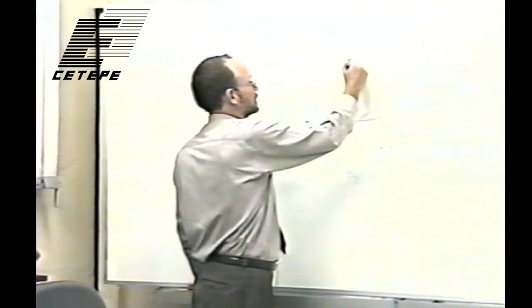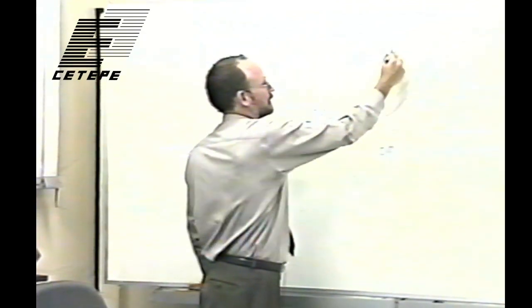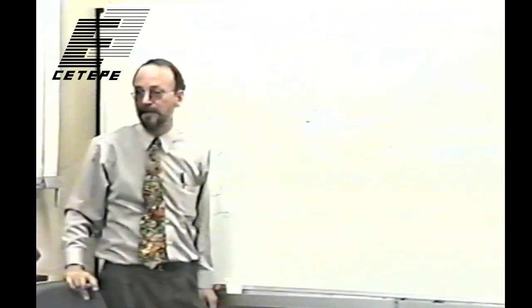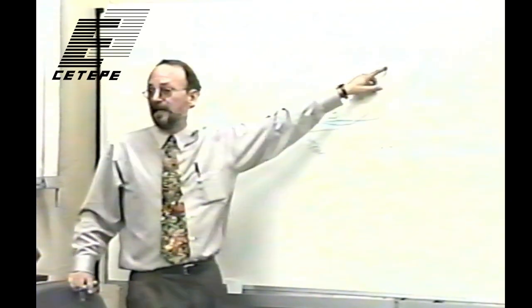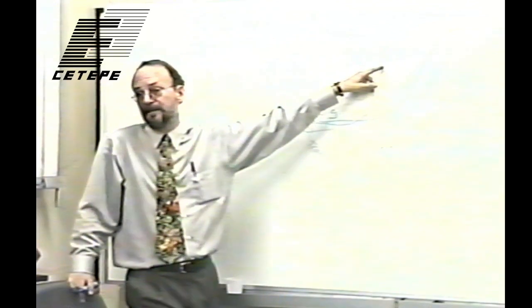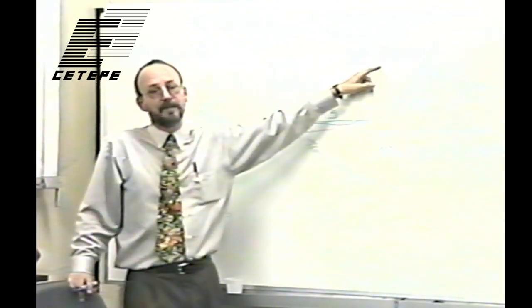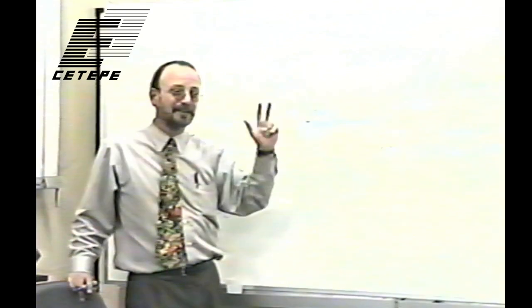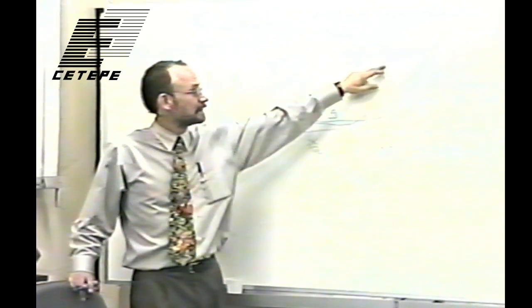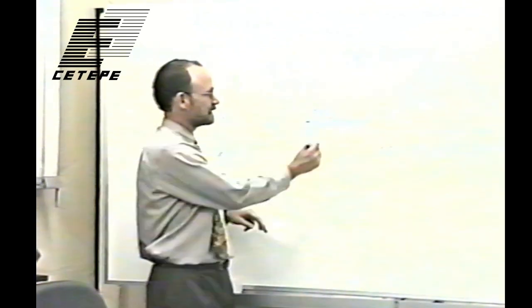I realize that a lot of you don't know at this point what dynamic range is, and we'll get into it a bit later, but basically the dynamic range of film is about 300, which means you can see beautiful images with film, but this is not a high dynamic range. A very high dynamic range is 100,000. A good dynamic range is, say, from 1,000 to 4,000. But 300 is okay, but it's not very good. And the reason that this is low is because of this noise here. This is noise.